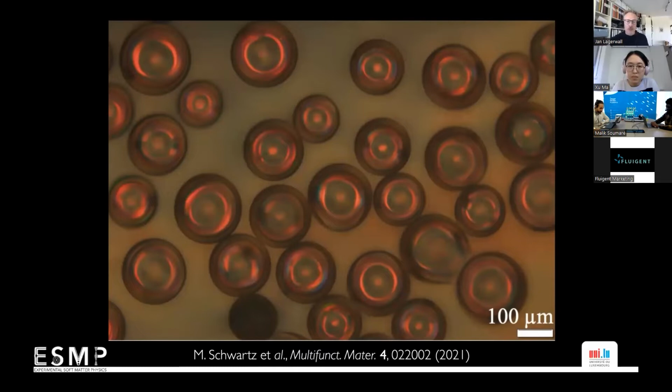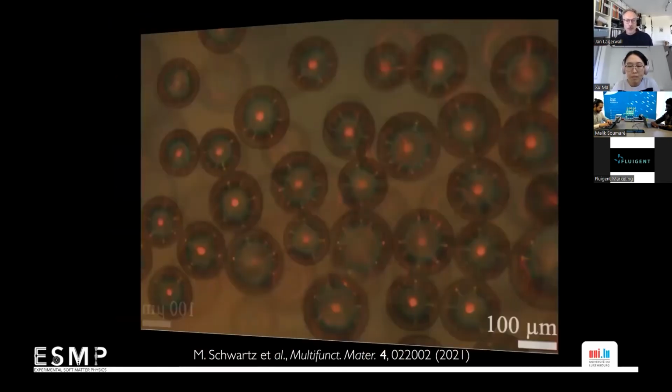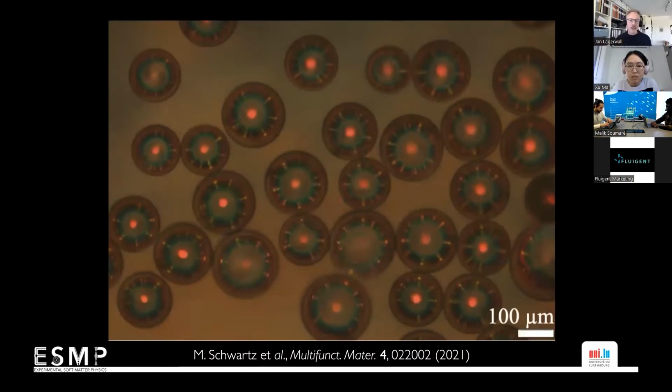So here we have a bunch of shells that are polymerized, and we are looking at them from the thin side. So we see rings, right? If you flip this over, exactly the same type of shells actually look very different, because now we have not the internal ring reflection, but what we call cross communication between the shells, giving rise to these spots.